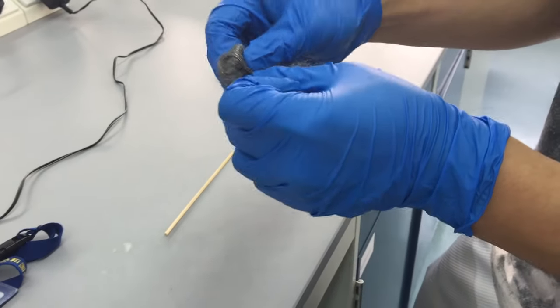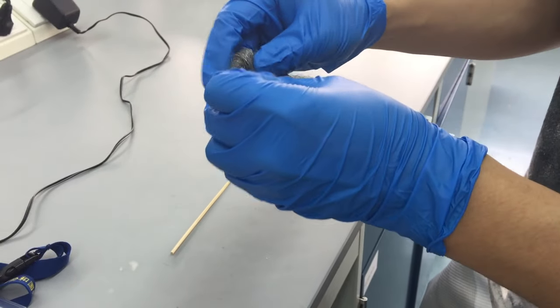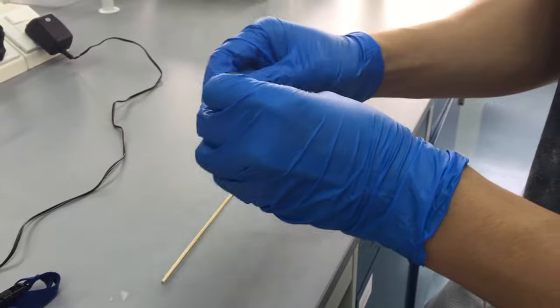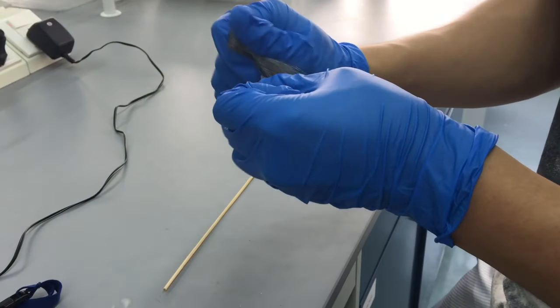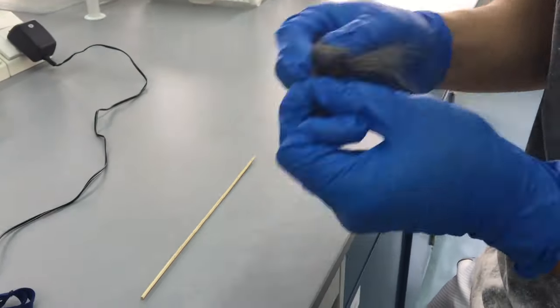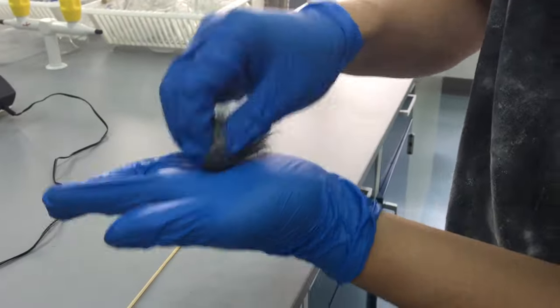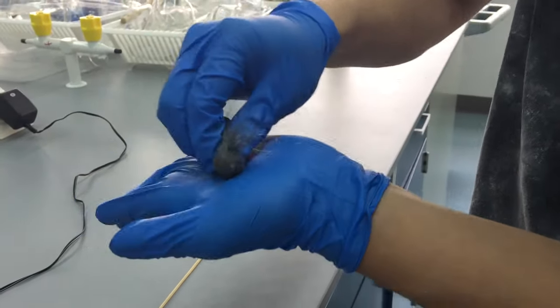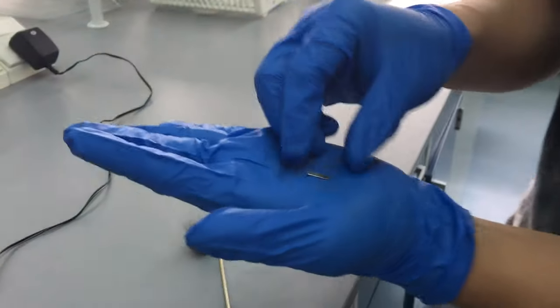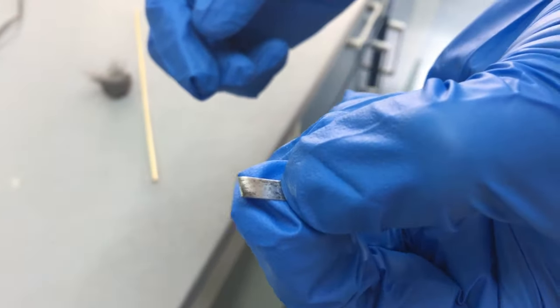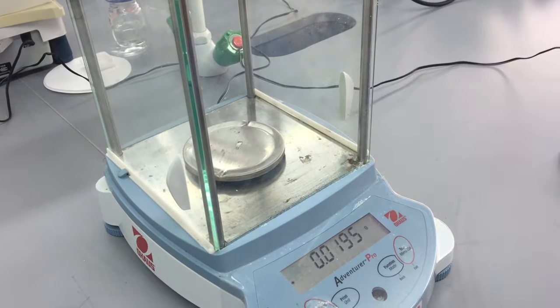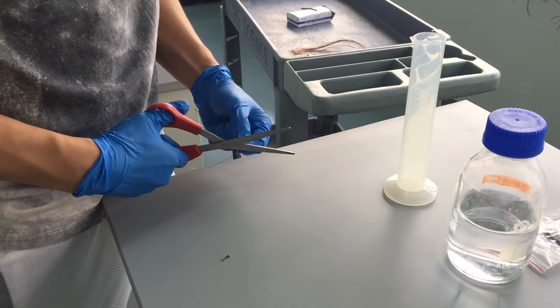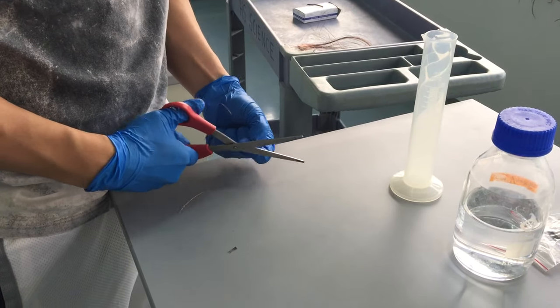First, sand a magnesium ribbon to get rid of the magnesium oxide layer so that the magnesium can react with hydrochloric acid. Then weigh the magnesium ribbon and cut a piece of copper wire.